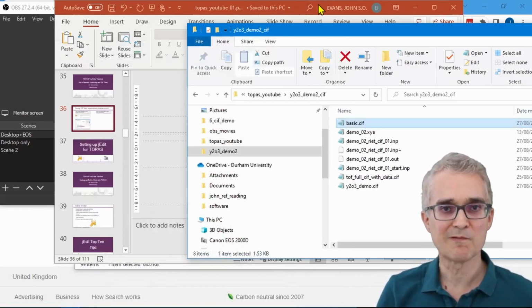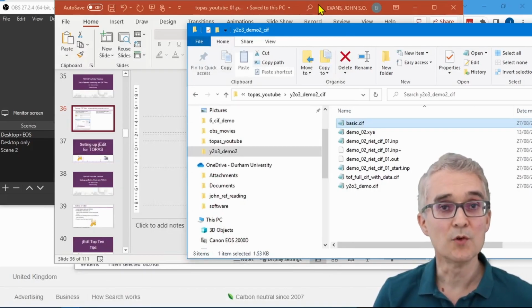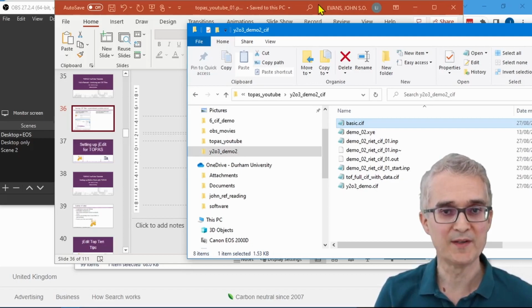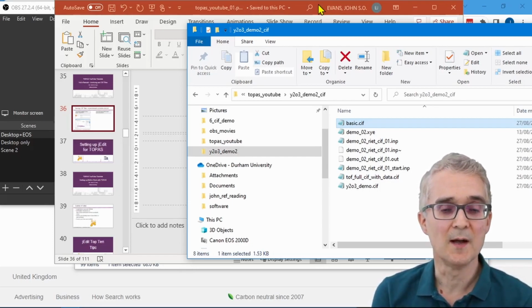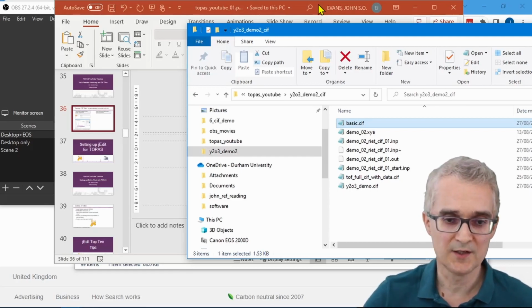But if you're trying to archive the results of your Rietveld refinement properly, then what you need to be doing is not just writing out the structural part of the CIF, you ought to be archiving the experimental data and the calculated model and some details about how you did the refinement. And that's where Matthew's routines and PD CIF plotter are particularly useful.